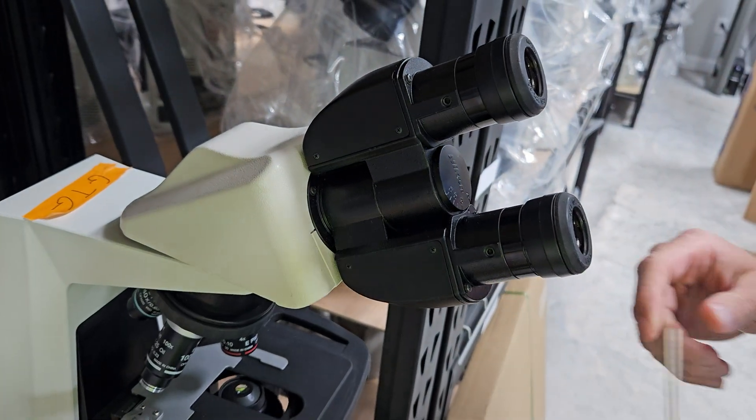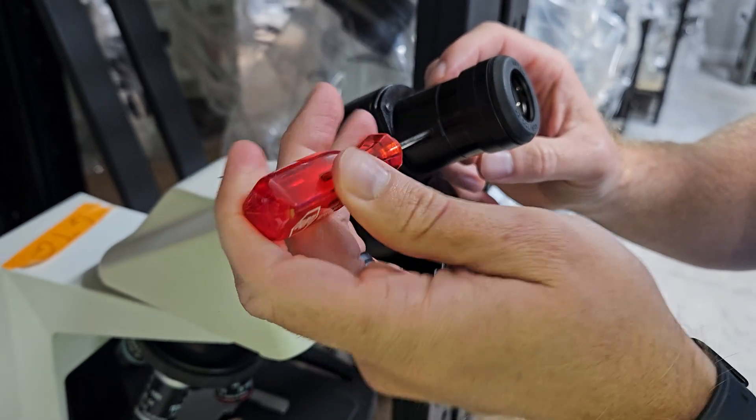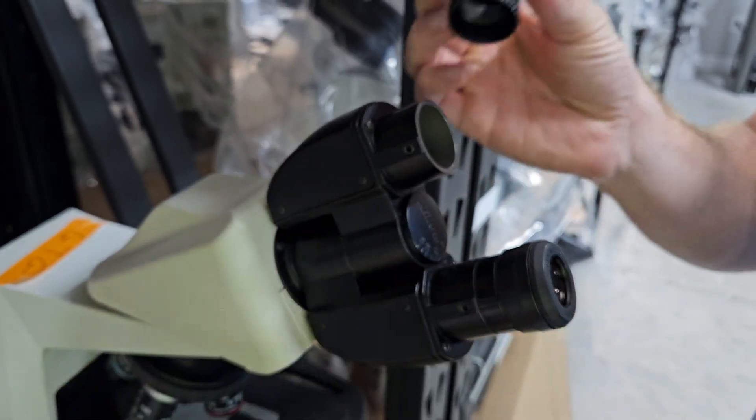So we're going to take a 2.5 millimeter Allen wrench, locate this hole right here, just loosen it, and then your eyepiece comes right out.